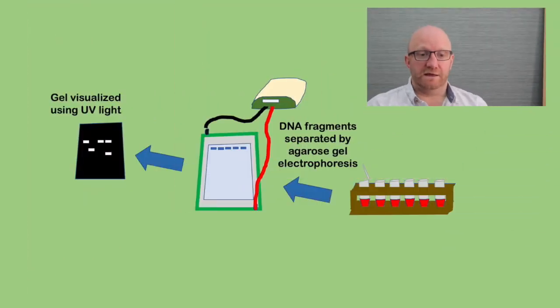Okay, from doing that, and from the final gel image, we'll be able to determine which products are present in each of our samples, and we'll be able to identify their relative sizes or their absolute sizes. From these data, we'll be able to interpret what alternative splicing has happened in each of our different mini-gene conditions.